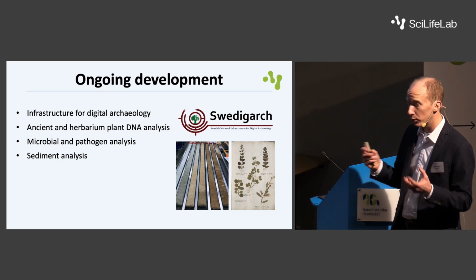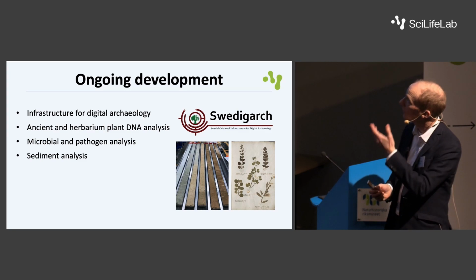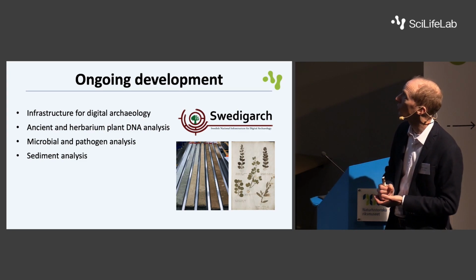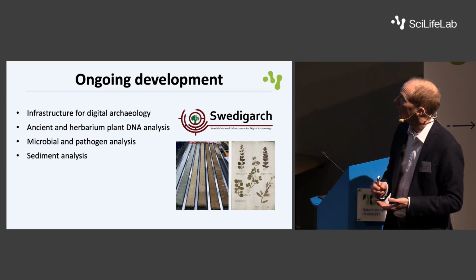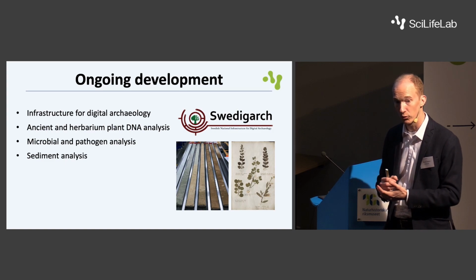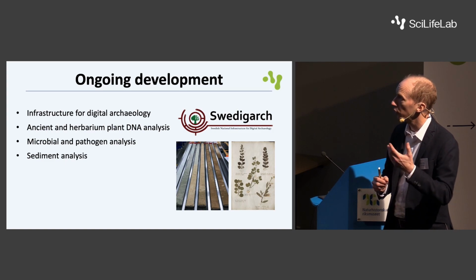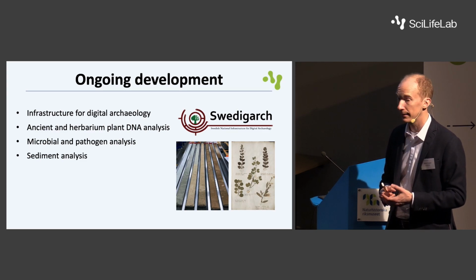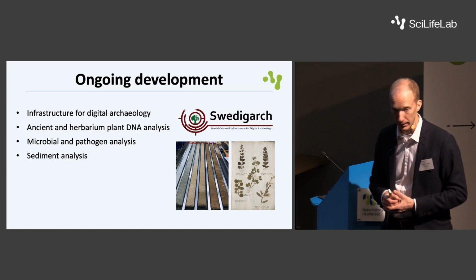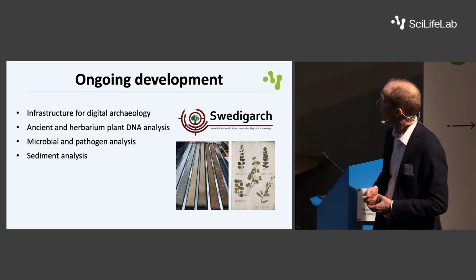A little bit on ongoing development. This is a fast-moving field, ancient DNA research. So as I mentioned, we're looking into making data available for researchers in a bigger context through digital archaeology infrastructure. We have development projects for increasing our knowledge and ability to support analysis of ancient plant DNA. Further developing microbial and pathogen analysis, and also looking into sediment analysis, we think is a really major field in the future when it comes to ancient DNA.